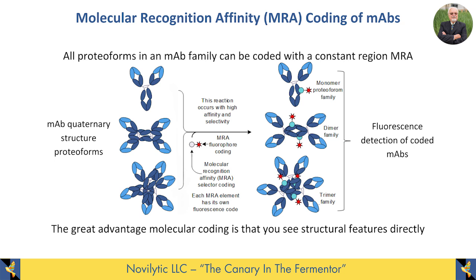So instead of taking the molecule apart to see how it's made, we do it another way. We do it by molecular recognition. What we try to do is go in and find some molecule, some coding agent, if you will, that will only see the molecule that we want to see, in the thousands and thousands of molecules that are made in a biological reactor.